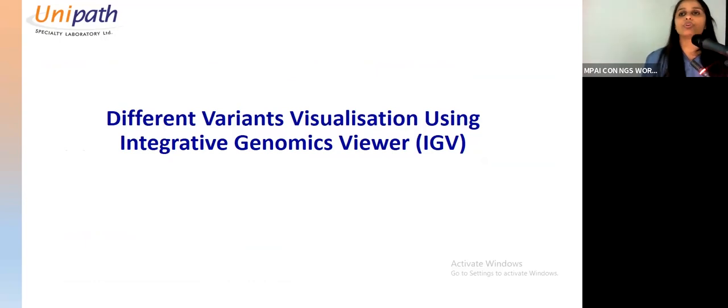Now you will know whether it's pathogenic or not. Chalo, you have taken a decision, that this is matching with your phenotype. Phenotype is very important. When you are talking, don't just talk about variants, but what is much more important is the phenotype. And as in the previous session, the doctor said, if you do not have the phenotype, you will not be able to proceed.